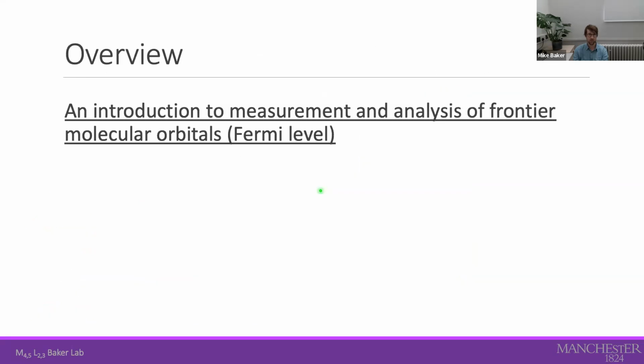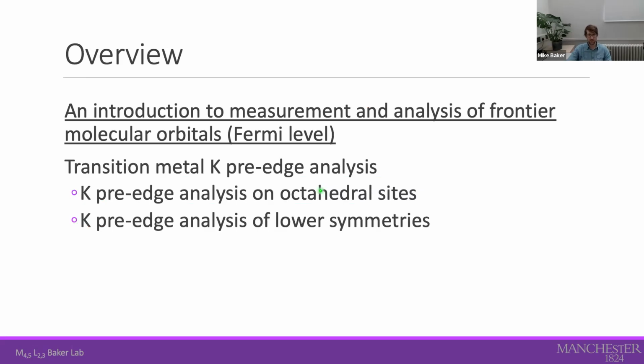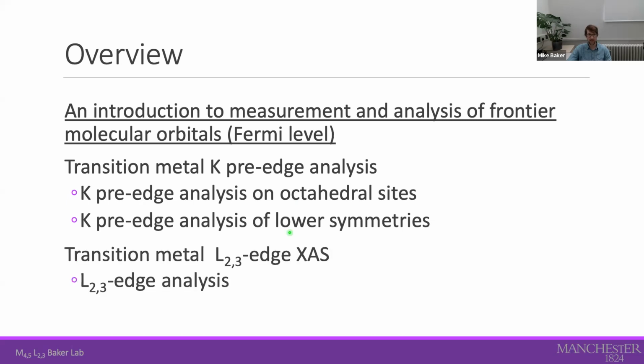So here's the overview. I'll be giving an introduction to the measurement and analysis of frontier molecular orbitals, and I'll do this, as I've said, with transition metal K pre-edge analysis initially. So I'll discuss K pre-edges for octahedral sites, and then make a brief introduction to lower symmetries. And then after that, I'll finally cover some L23 edge X-ray absorption spectroscopy and analysis for first row transition metal ions too.